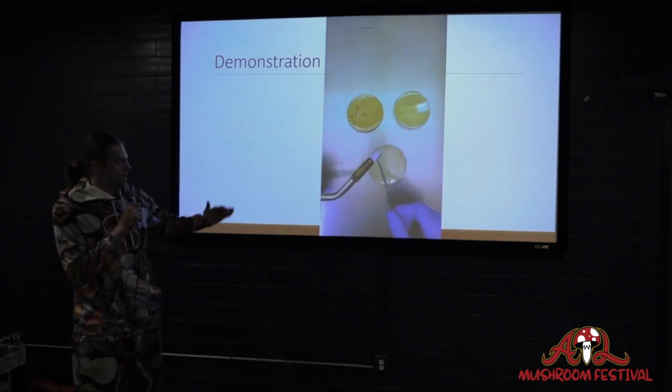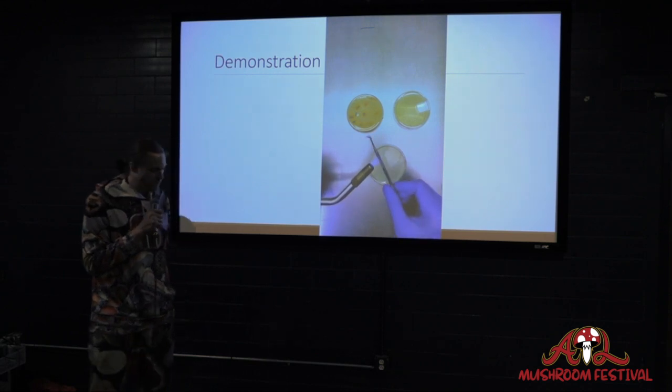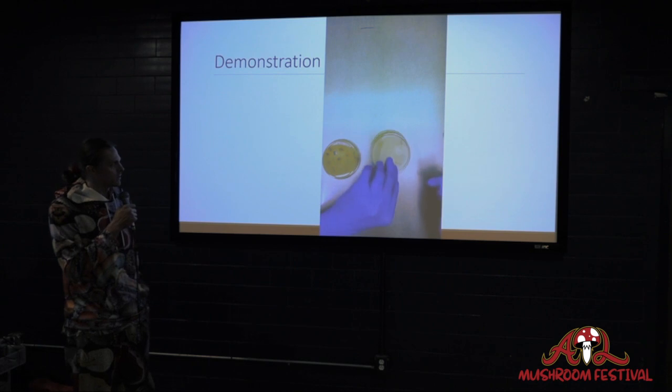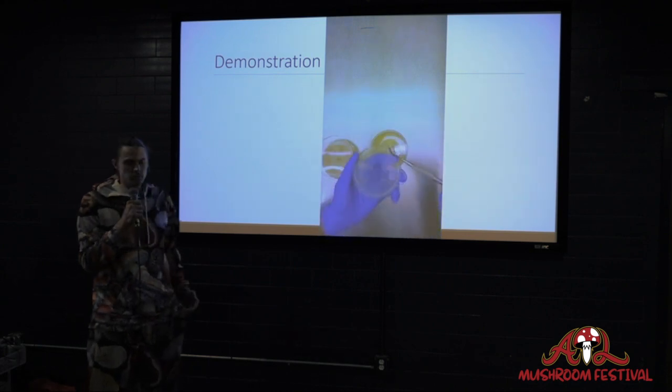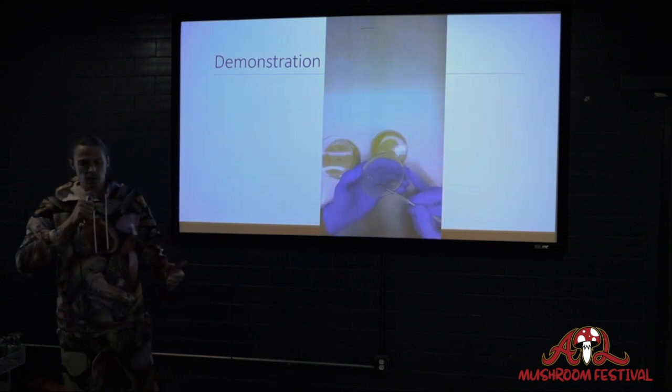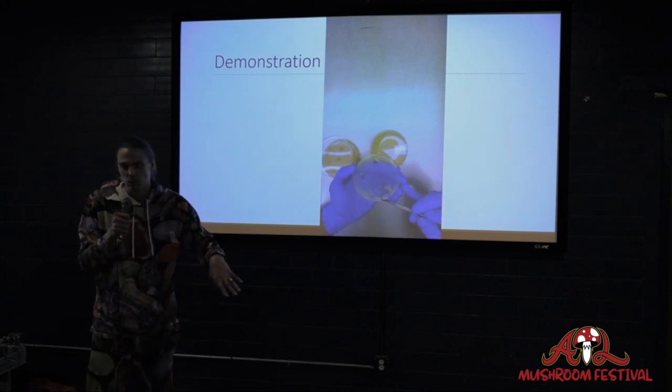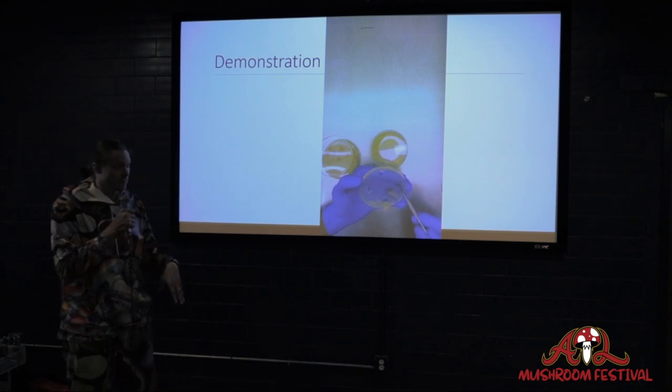So with this, instead of making 1 hole, we're going to make 4 holes. And what's great is that you can run them all on the same plate. And so it makes it really easy that if you have a sample, you can run multiple samples on one plate, which saves you a lot of time and energy.